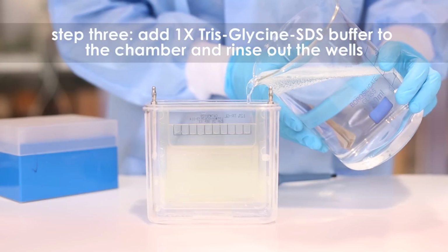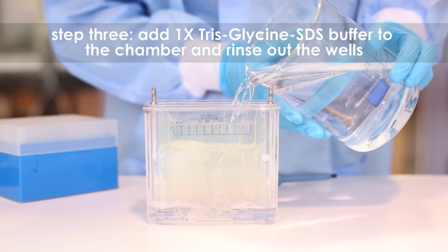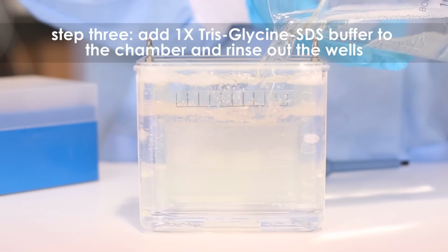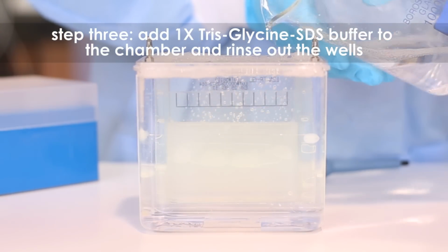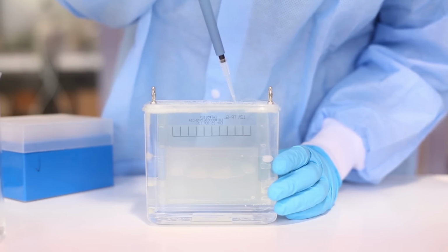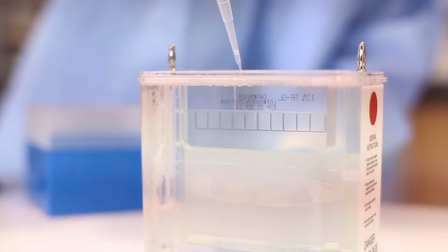Step 3. Add the 1x tris-glycine SDS electrophoresis buffer to the chamber. The sample wells and the gel cassette should be completely submerged. Rinse out the wells using a small transfer pipette or micropipette.